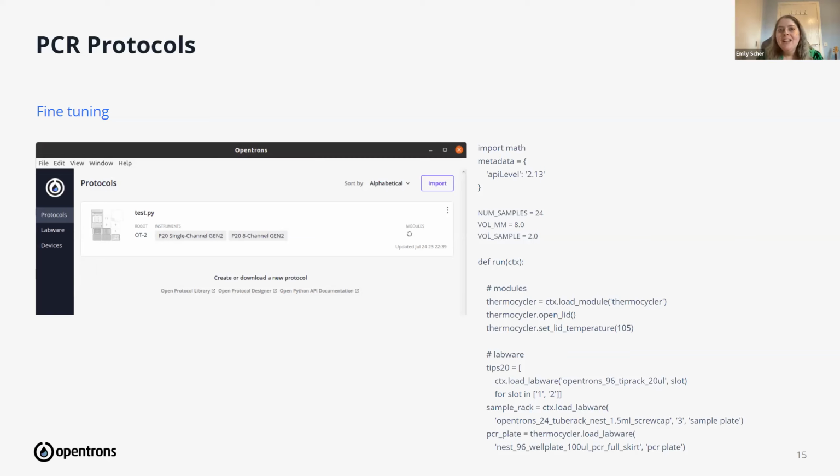If this was a more traditional machine learning problem, we would have a much more robust set of evaluation tools. But unfortunately, for this, we have a small amount of data. We already have a pretty well-trained model. The underlying data is very unstructured, so it makes it a little bit more difficult.